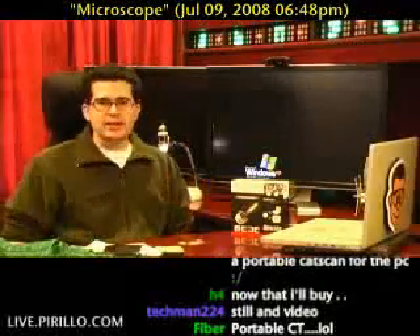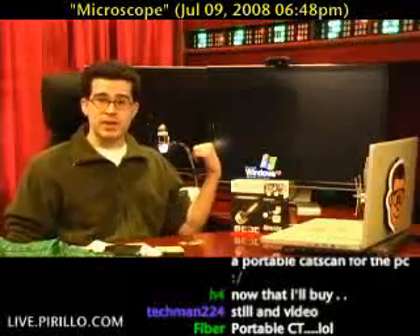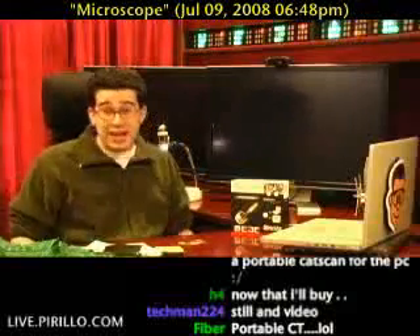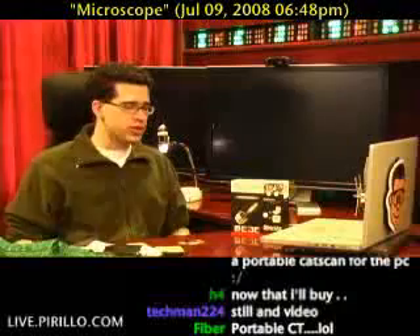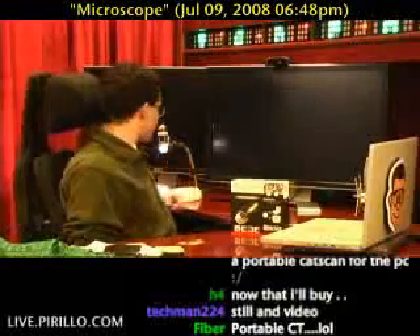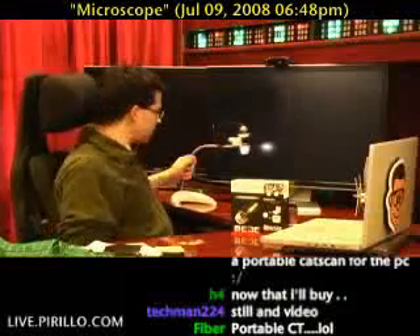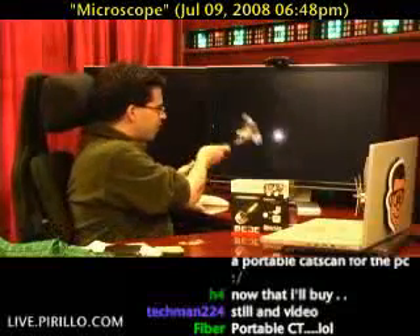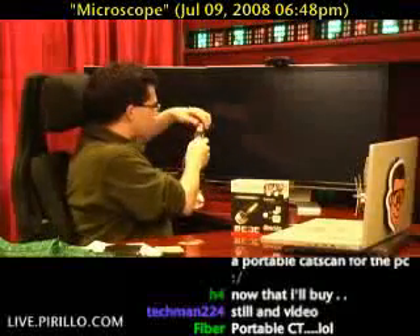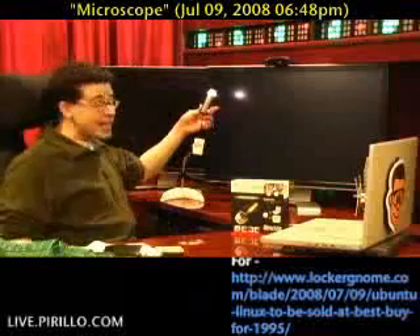No matter — I've got VMware Fusion running here, so I've got the USB microscope connected to that right now. The Windows software is okay, it's not amazing, but it does work. It records video and still photos. You can toggle things on and off, mostly in software, because this is the hardware. The stand is right here. It's got this neck that can bend and pivot and stay stationary. The USB microscope is currently strapped on by Velcro straps.